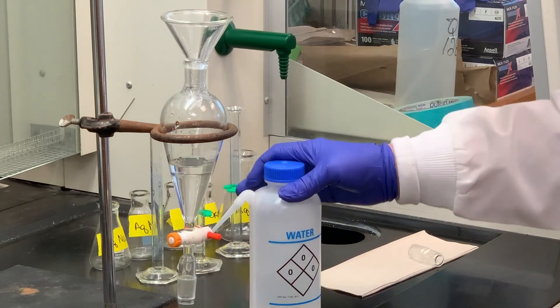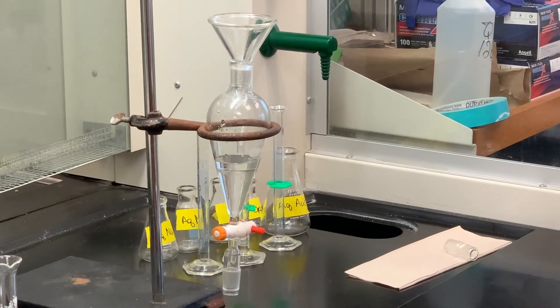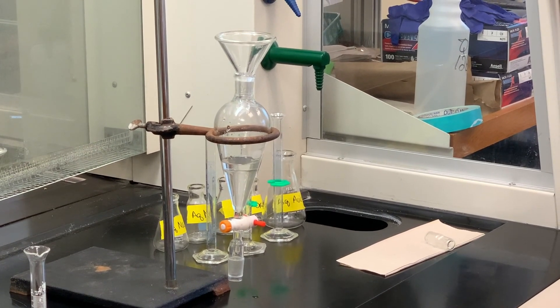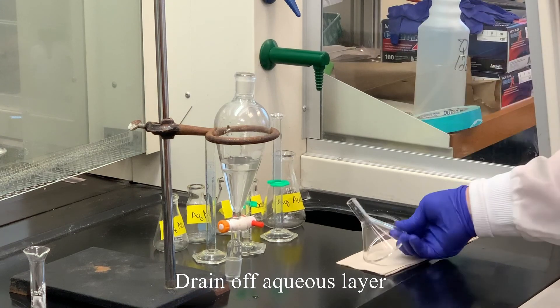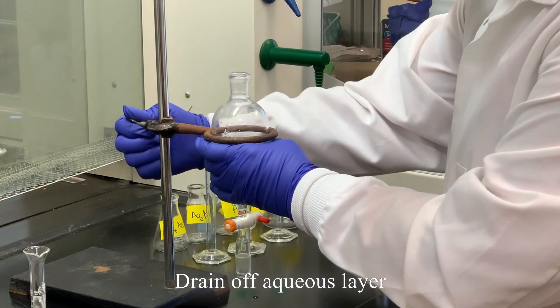So what I want to do first is to drain off, because I don't want to wash the aqueous with anything, I want to wash the organic layer. So what I have to do is drain off the aqueous. In this case, we've realized it was on the bottom. I'm going to raise this up just a little bit.